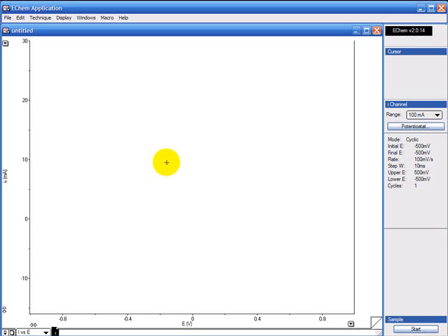This screencast training video shows how you set up the eChem software to do cyclic voltammetry. First you connect the potentiostat to the ecorder as described in the manual and then open up the eChem software.